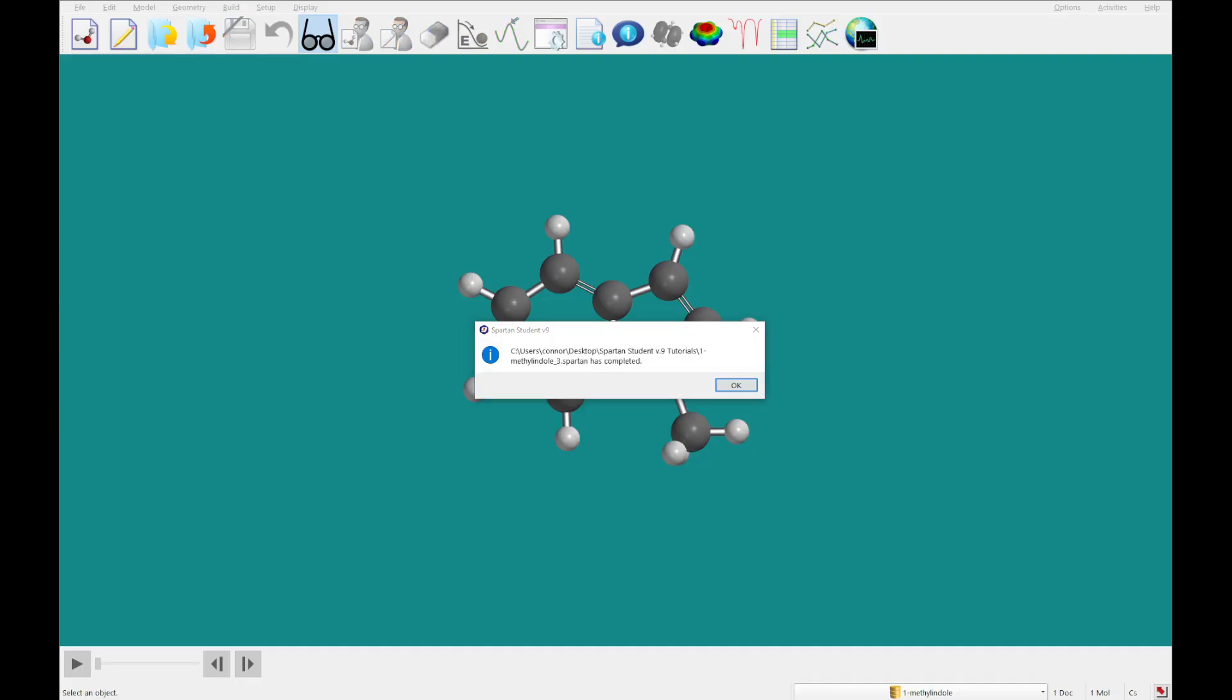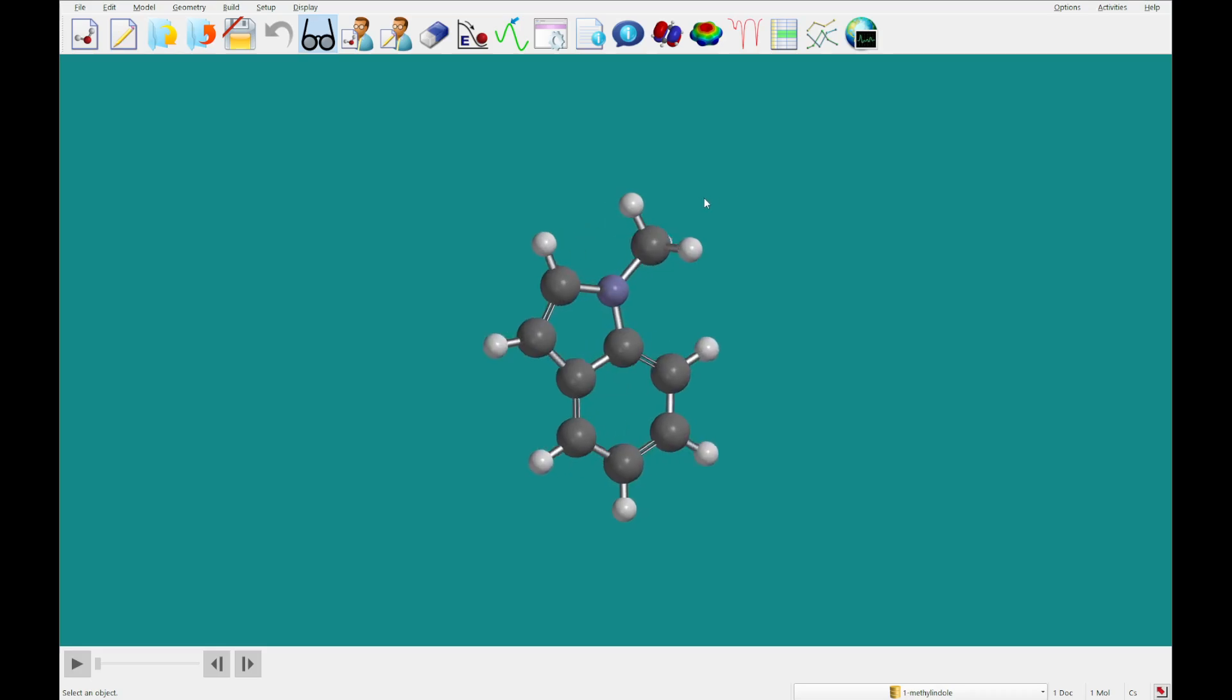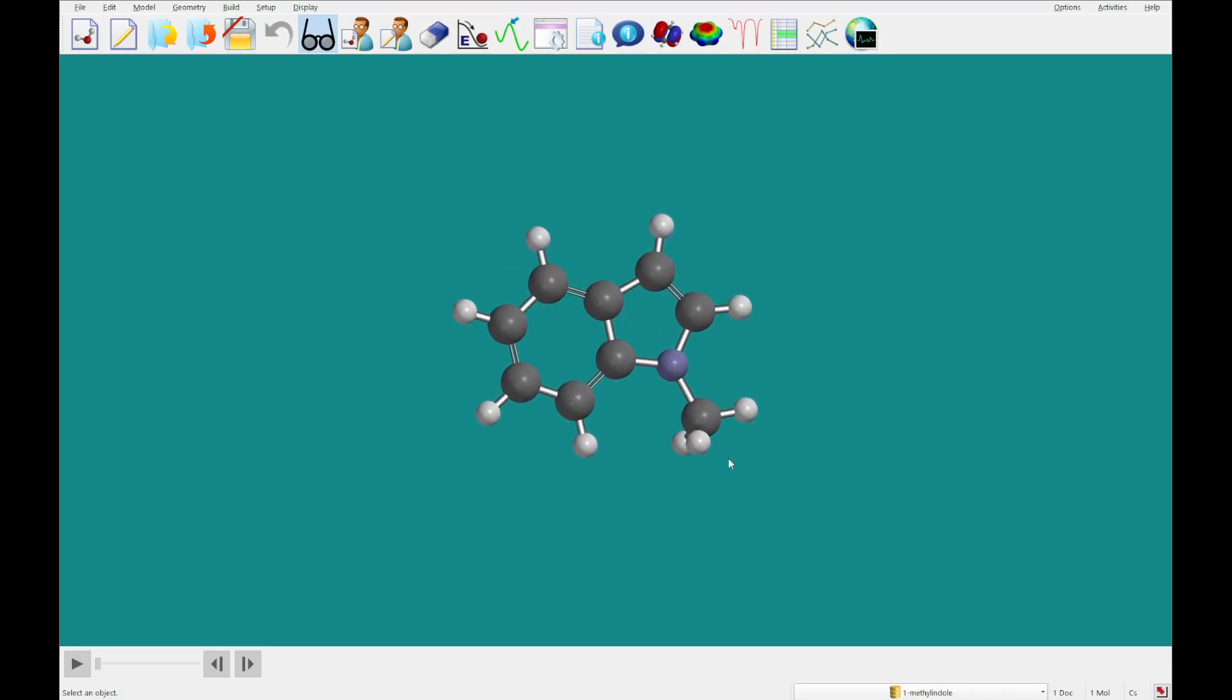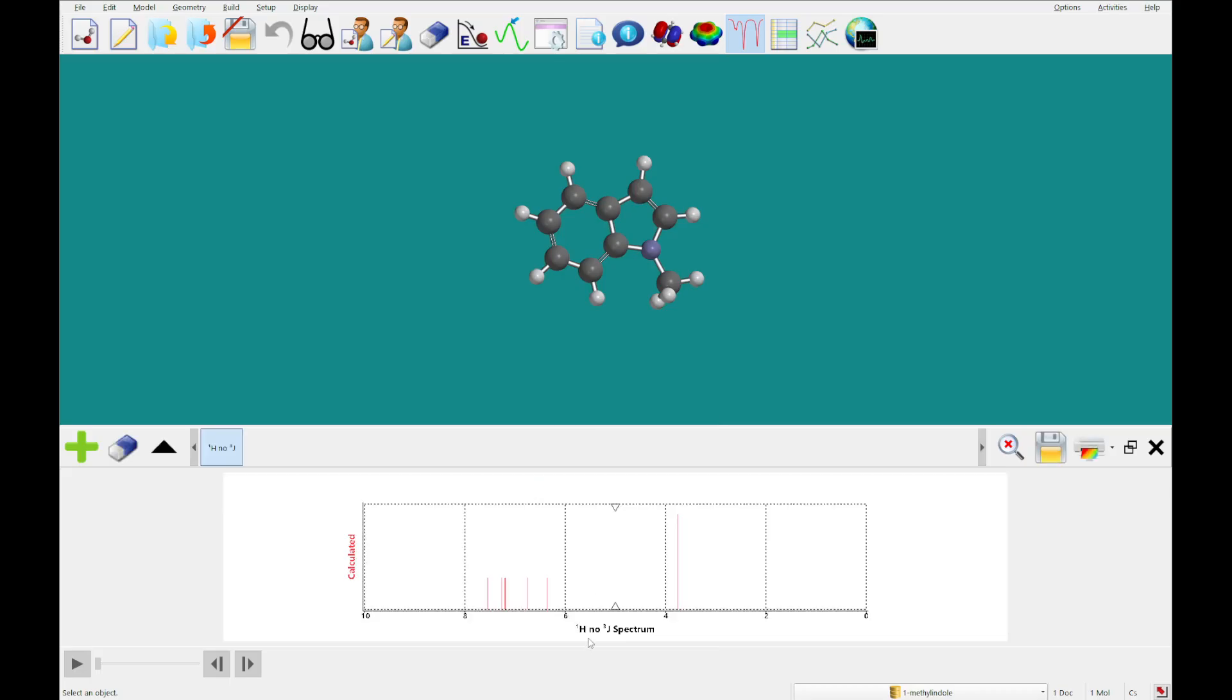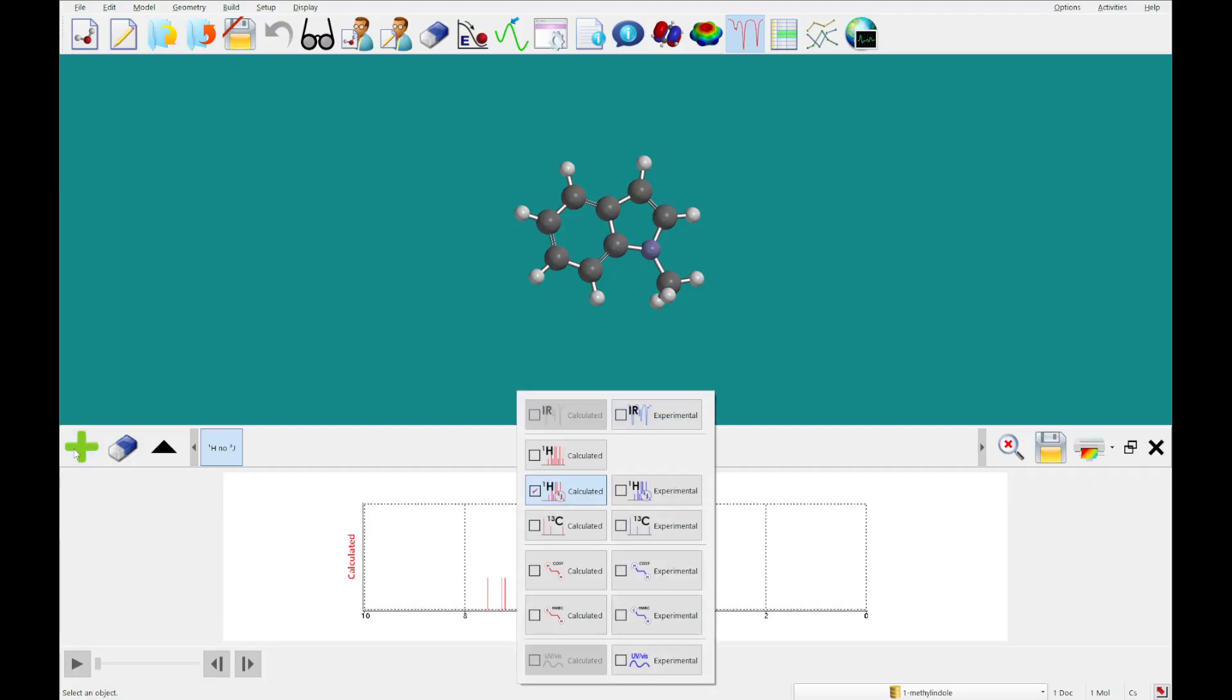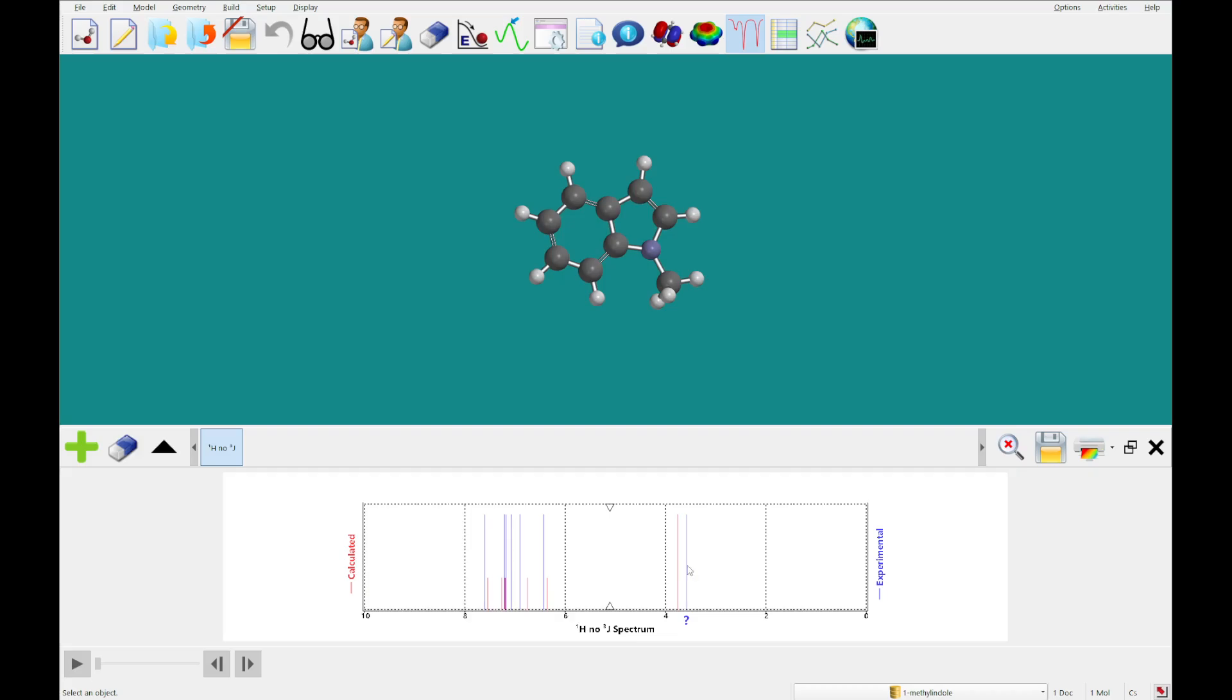Alright, so that calculation's just completed. We're going to go ahead and open the spectra panel again, but this time we are going to add the hydrogen shifts, and this is going to be with no coupling constants. So, you'll see each one of these corresponds with one hydrogen, and there is a triple peak here that corresponds with the methyl hydrogens. And if we add the experimental data here, then we can get a comparison between what we calculated, and what's going on experimentally.